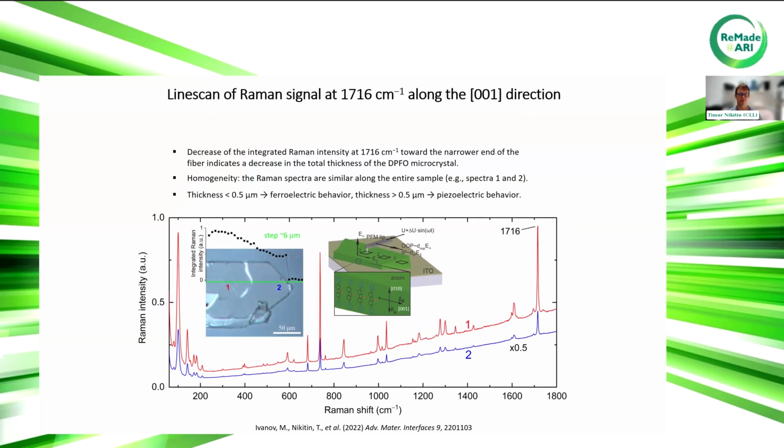And here we also performed the Raman line scan on this molecular crystal, and we integrated the strongest band.